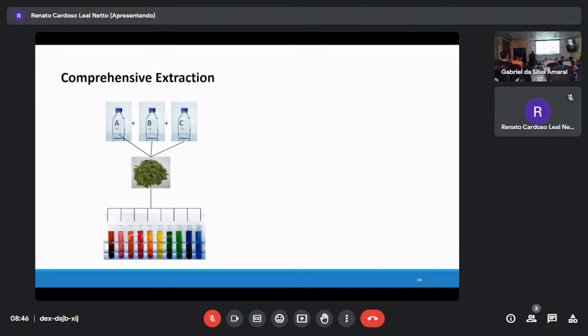For example, now we have an unknown plant. Like yesterday, you mentioned the case of Alithia. You have a plant material, and according to the reference, because you selected unknown plants, fewer metabolites are reported. In that case, if you use only one extraction, you will probably lose some compounds. For that extensive work, probably you can start, and then you can do metabolic profiling.